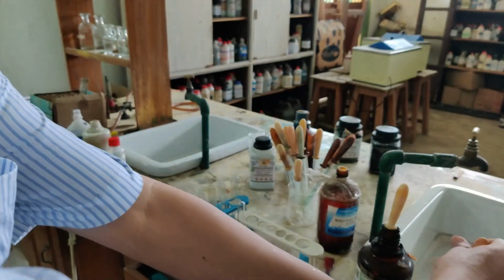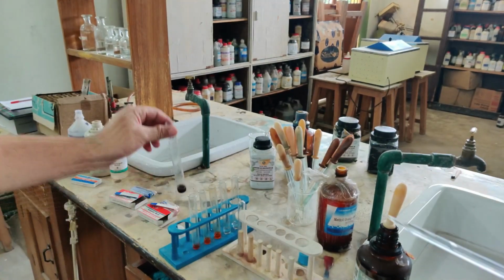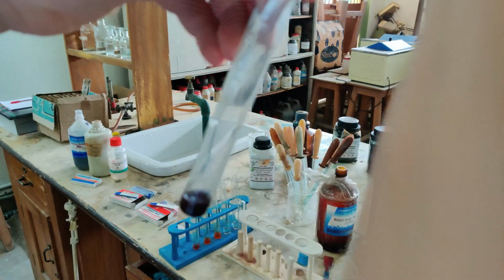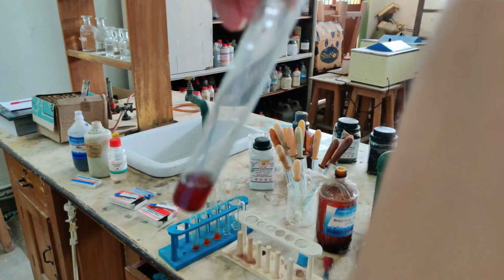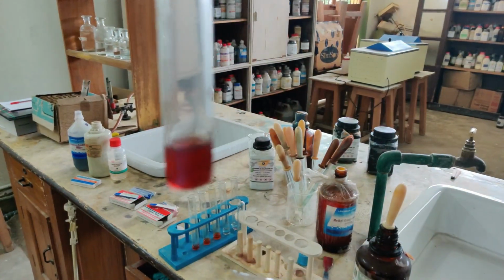So let's see what changes you notice when I add dilute hydrochloric acid. You can see now I am adding to this, you can see the blue litmus color. Now let's see whether you see any change in the color taking place. So now you can see the blue litmus solution has turned to red. You can see it has turned red.